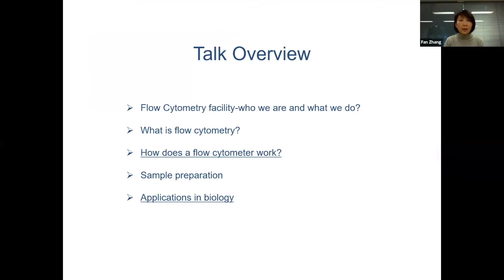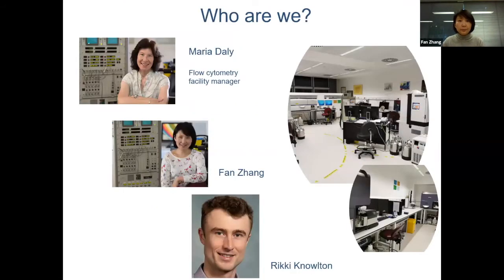So in this talk, I'm going to introduce our flow cytometry facility and talk about what is flow cytometry, how does a flow cytometer work, sample preparation, and some examples of applications that have been done here in LMB.